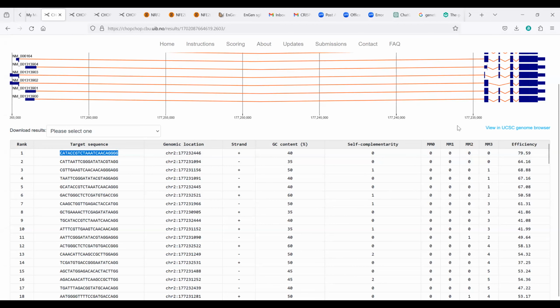That's good. Now, for these 20 bases, for a mismatch of 0, meaning the exact sequence, whether it is repeated elsewhere: no. So the off target is 0 for MM0. For a mismatch of 1, suppose any one out of the 20 bases in the protospacer is changed to any other nucleotide, whether a similar sequence will be present in some other chromosome or place.